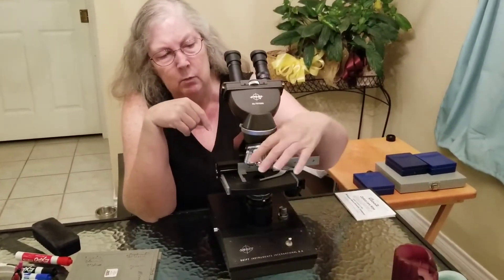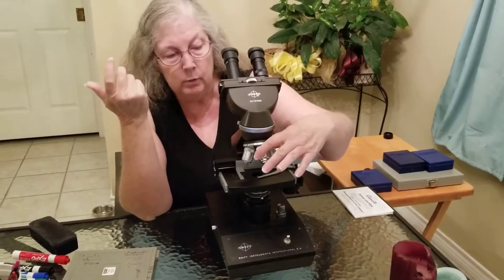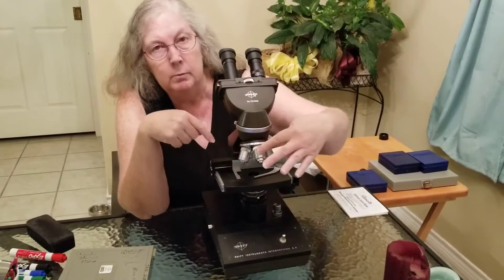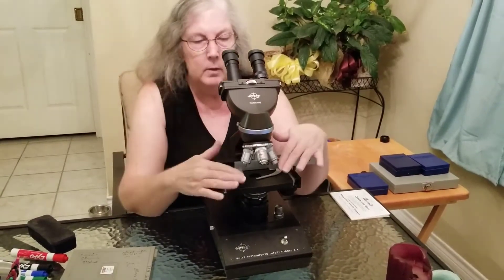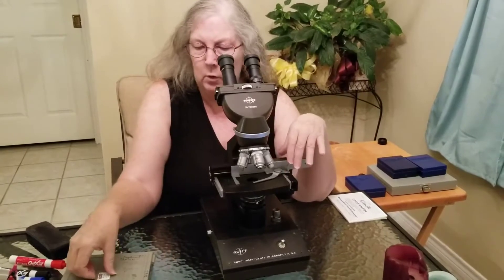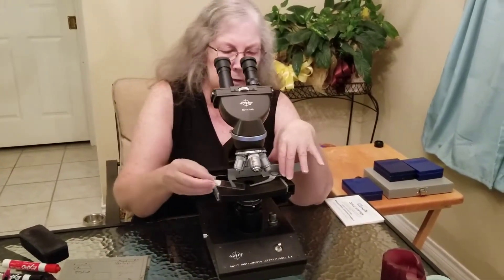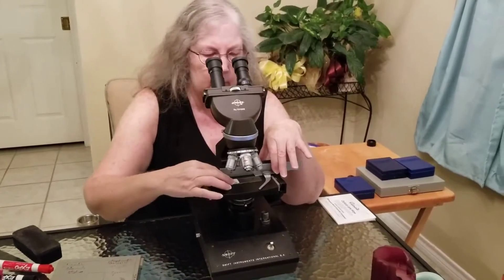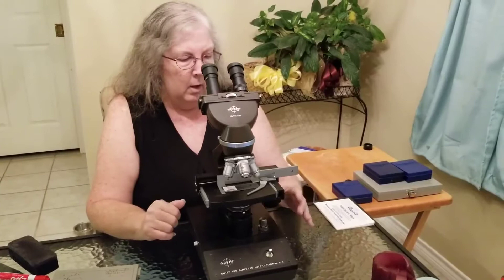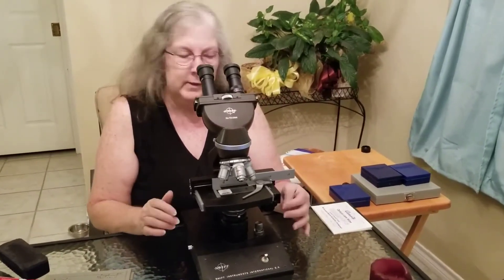The nosepiece moves and rotates around, so it's sometimes referred to as a revolving or rotating nosepiece. These are your individual objective lenses. This is your stage, and there is a clip here that's going to hold your slide sample in place. When you take a slide, that clip just helps to hold it in place — it varies by brand which side it will be on.